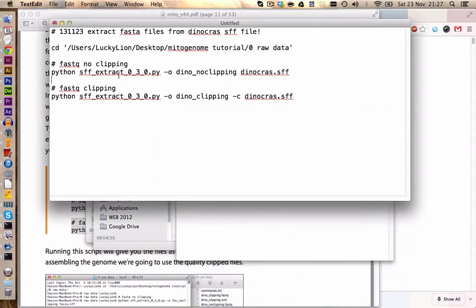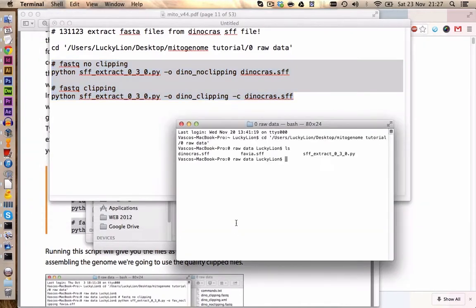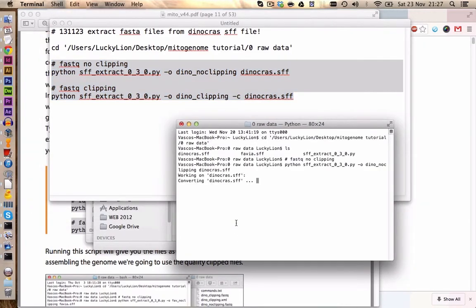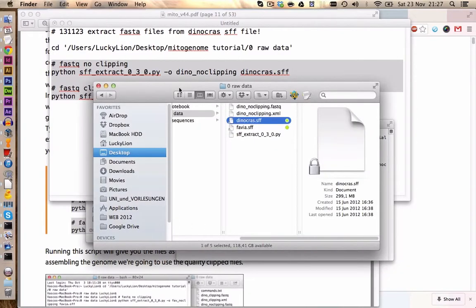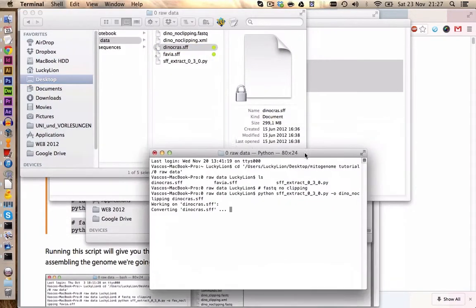With this command here we will execute the script. In this case I just will copy both and run them in here. It takes some minutes. Let's take a look also at the folder what is happening.